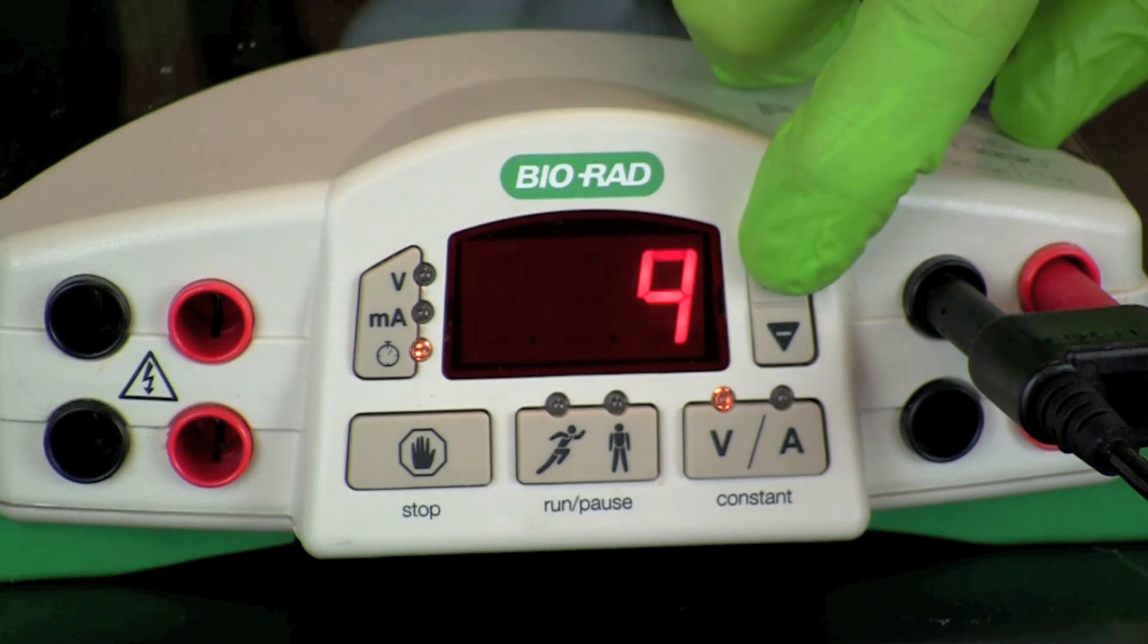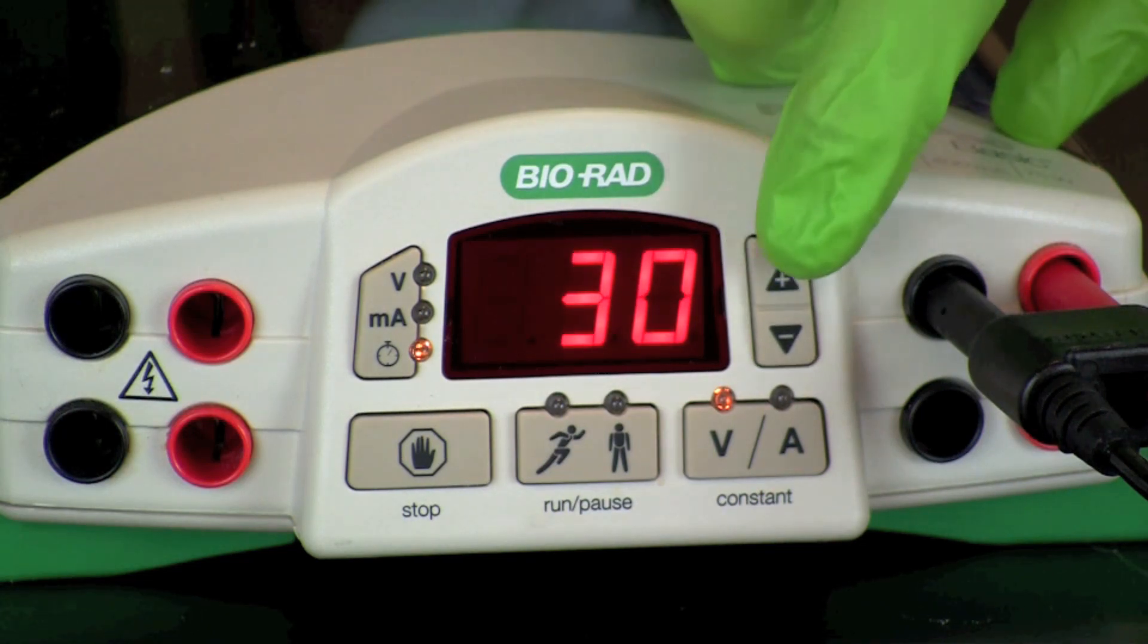If a timer is available, set the timer for 30 minutes. As the power is turned on, look for the release of bubbles from the electrode in the inner chamber.